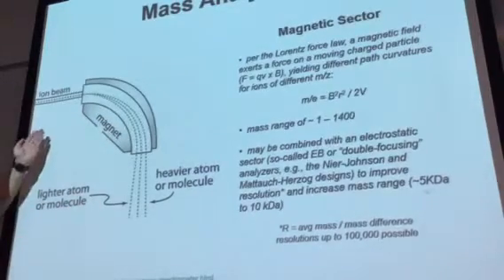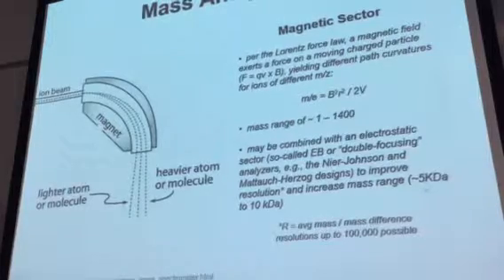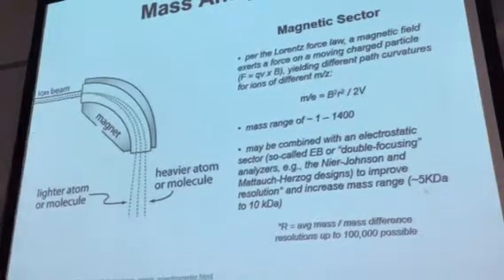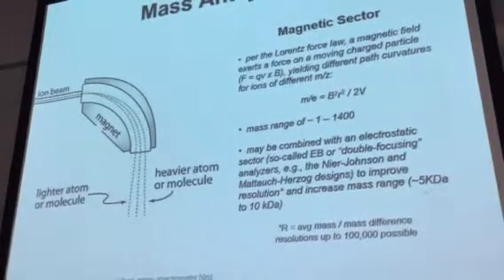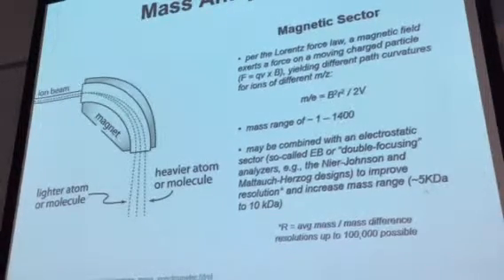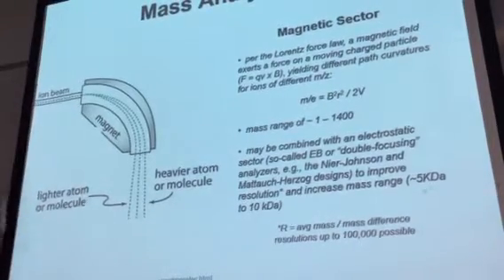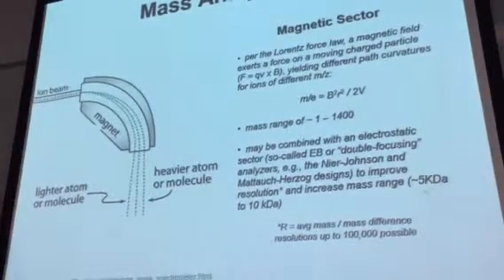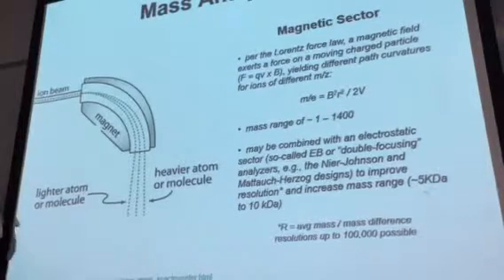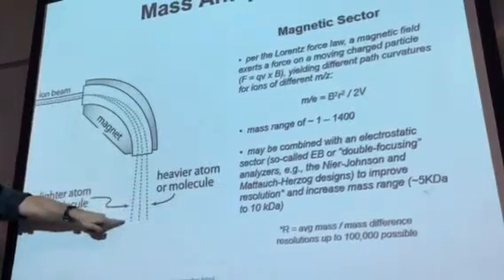So this is analogous to the dispersion of light by some element like a prism or a grating. You've got a bunch of, say, what would the corresponding term? Not polychromatic light, but polymassive ions, ions of different mass. Right? They travel through this magnetic field. Their directions of travel are affected to different extents based on their masses, right? And so they are deflected to different extents.